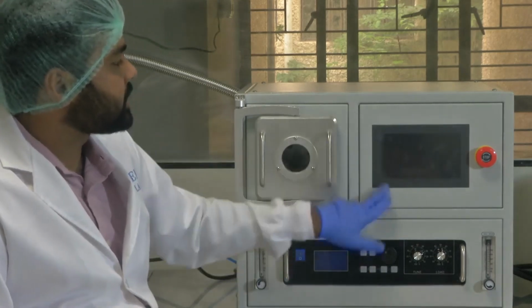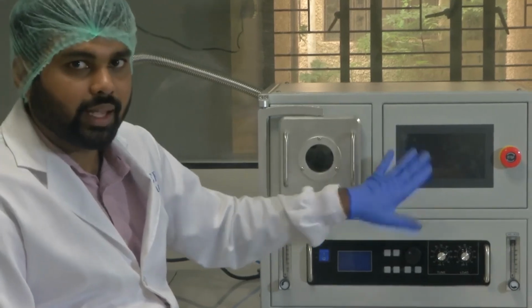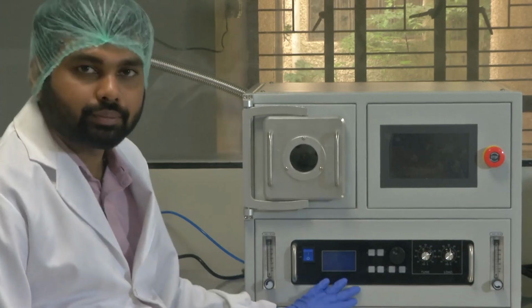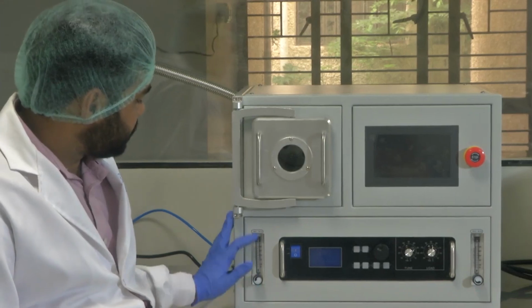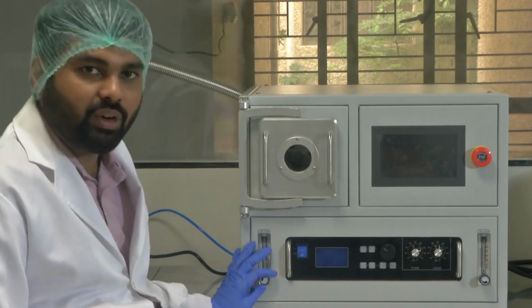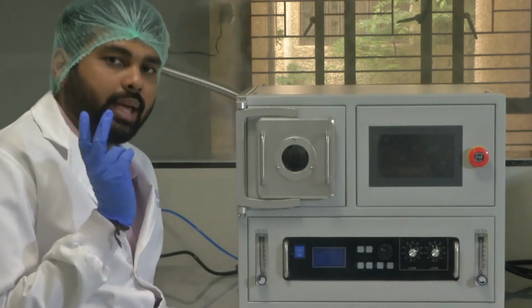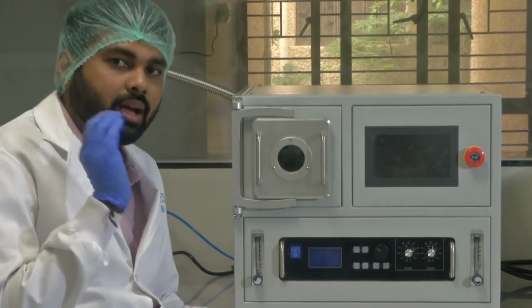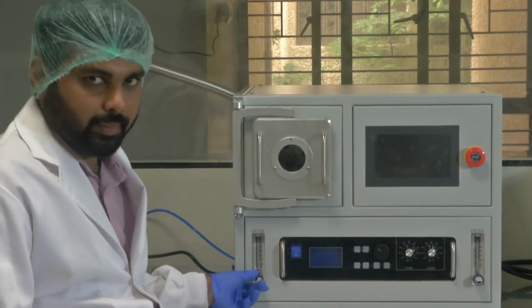Now this one is the interface panel, which is a touch display where we switch on and see how to control things. This one at the bottom is the RF control port. These 2 indicators are the flow indicators for the gases. This is gas in A and gas in B. I told you that there are 2 gas inlets. For each of the gas inlets, there is a flow meter here. We can see the flow rate at which the gas is coming in. And we can fix it by controlling the knob here.